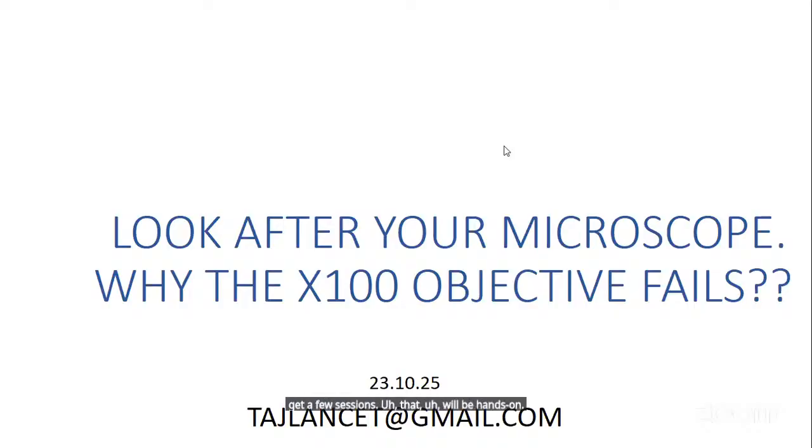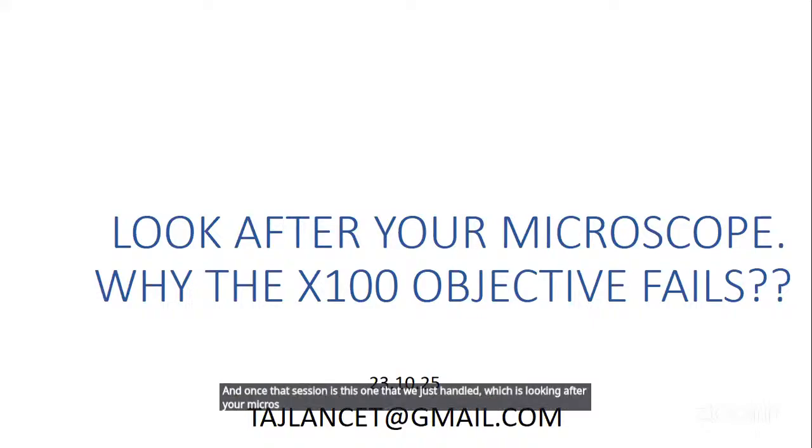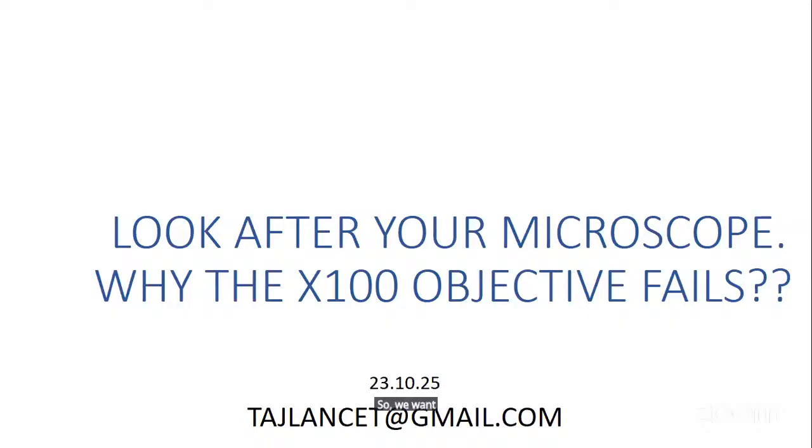And one such session is this one that we just handled, which is looking after your microscope and why the power 100 objective fails. So we want to continue to capacity build ourselves, and especially on these hands-on skills that all of us need to have.